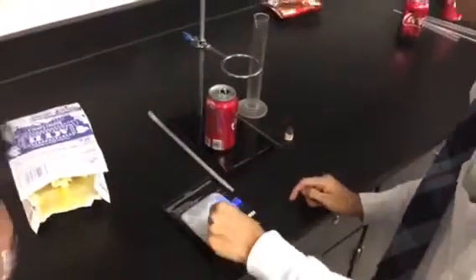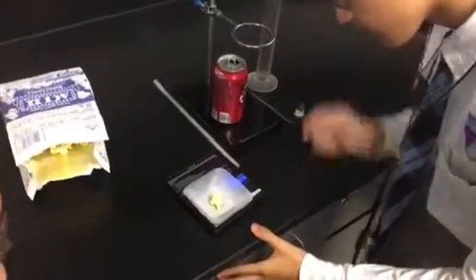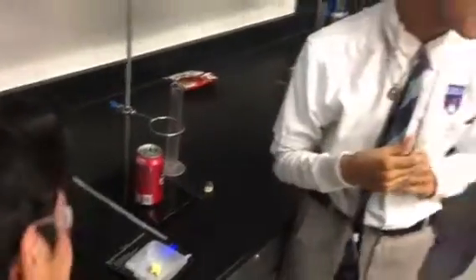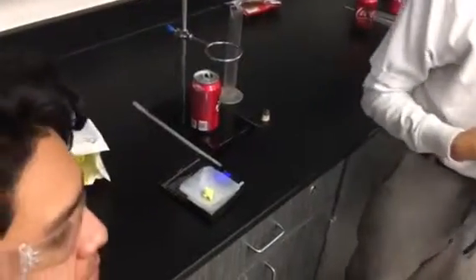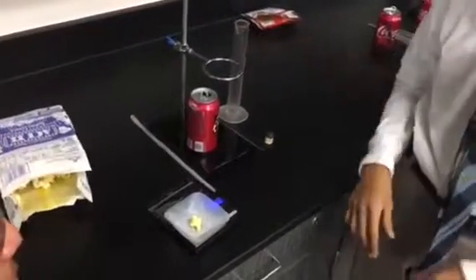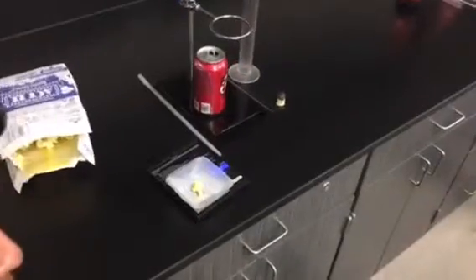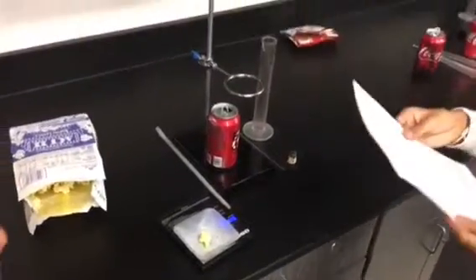So right now we're measuring the popcorn right here to see how much we have. It's 0.0. It's 0.2. Someone must have taken this. Okay, continue. What's the next? 1.5 grams.